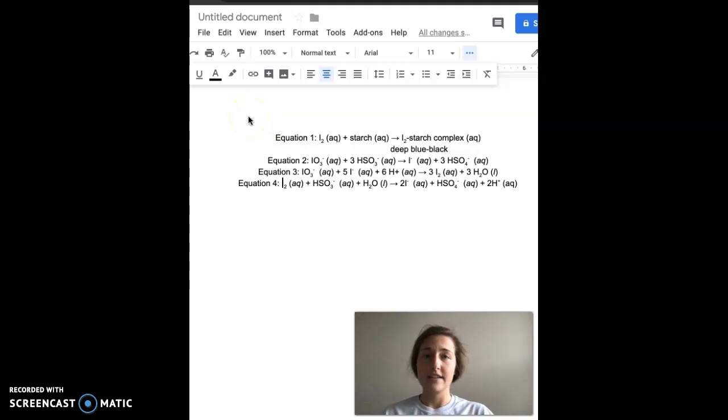For week two's interactive advanced concept assignment, we did a chemical clock experiment. Solution one received 1,000 milligrams of vitamin C. I had 500 milligram tablets, so I used 4 tablets, which were dissolved in 60 milliliters of distilled water and 12.5 milliliters of povidone iodine solution, which was 10%.